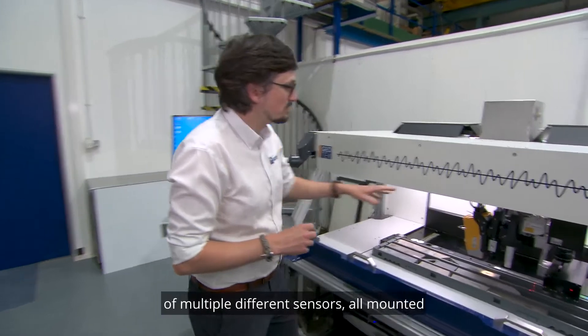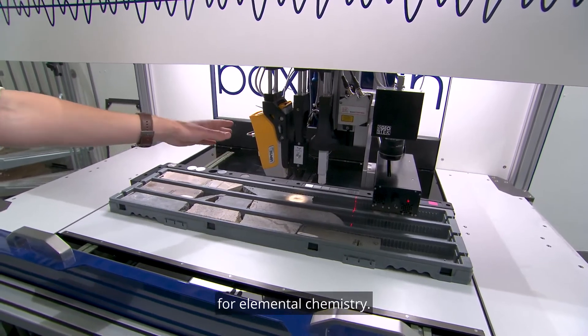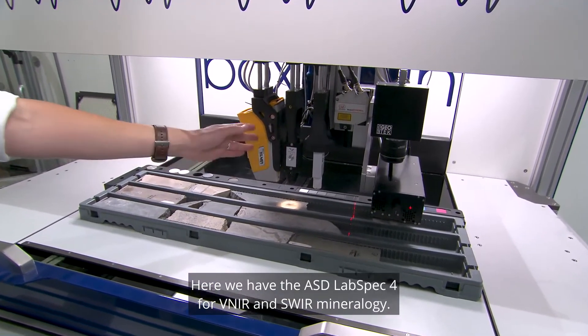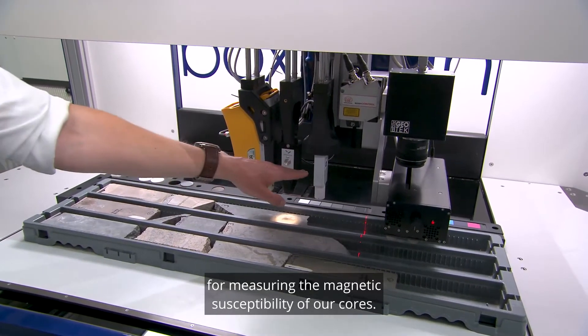The BoxScan system is composed of multiple different sensors all mounted onto a motorized arm. Here we have the Olympus Vanta XRF system for elemental chemistry. Here we have the ASD LabSpec 4 for VNIR and SWIR mineralogy. Here we have a point magnetic susceptibility sensor for measuring the magnetic susceptibility of our cores.